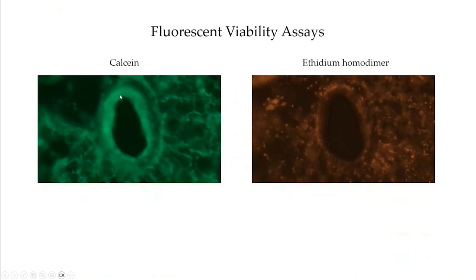But if you raise the thickness to 200 micron, you'll have intact smooth muscle rings a greater percentage of the time, and I think that's better. That's why I like the 200 micron thickness, because as you decrease the thickness of the slice, as I said, you'll increase the frequency of smooth muscle rings that are not intact, that do not have smooth muscle all the way around the perimeter.